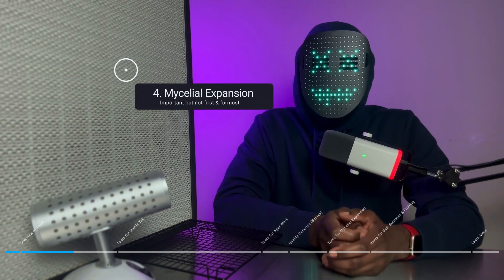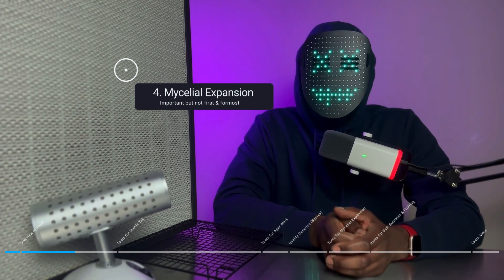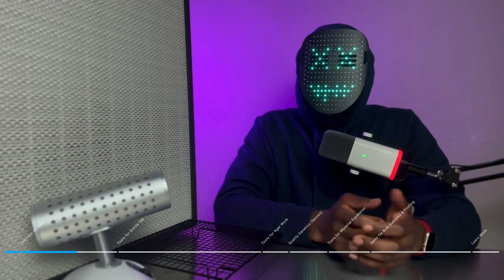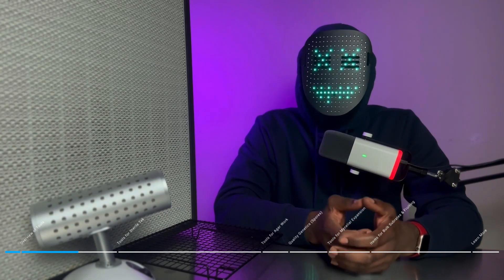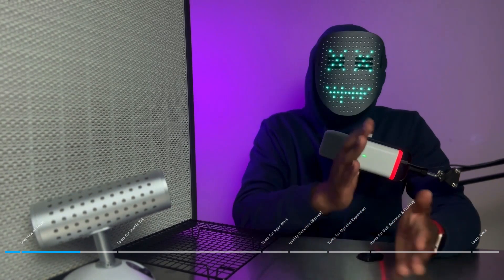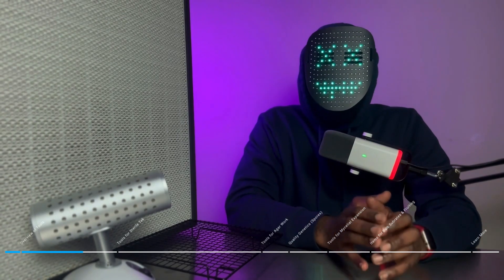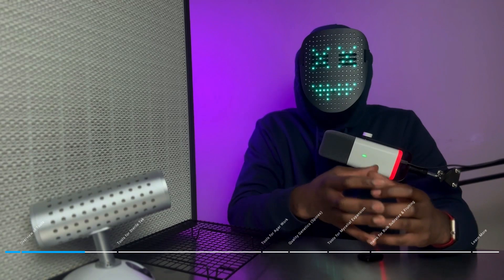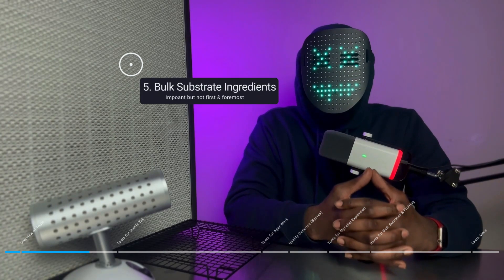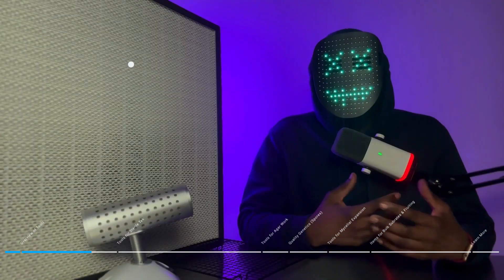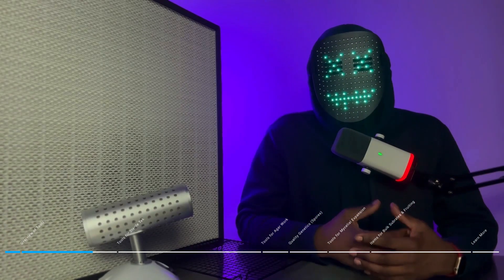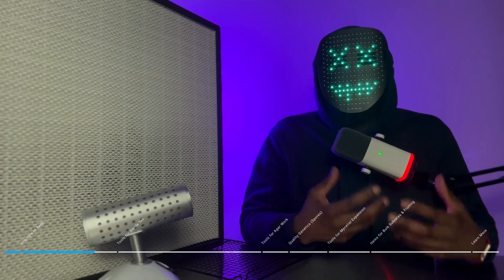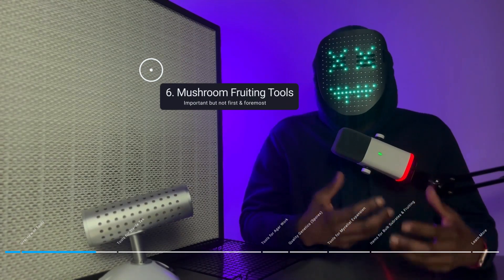The fourth category consists of tools that are necessary for mycelial expansion. So after we've committed our genetics to agar, everything has grown out, no contamination anywhere. Now we want to choose a grain to expand our mycelium on. The fifth category consists of ingredients for your bulk substrates. And the sixth and final category of items or tools that you guys would need is for mushroom fruiting.